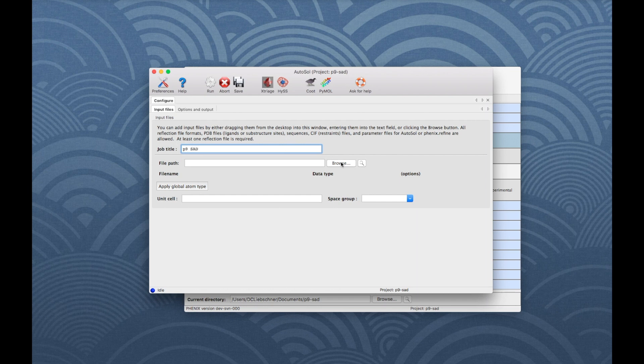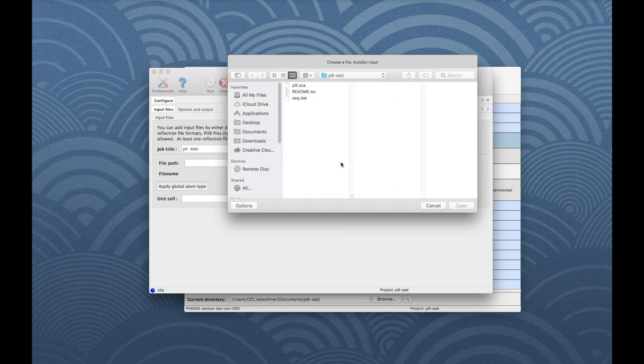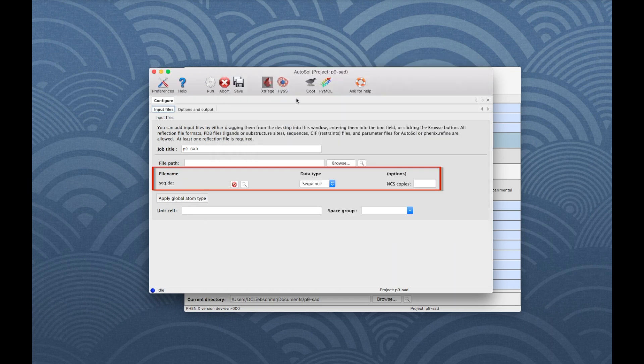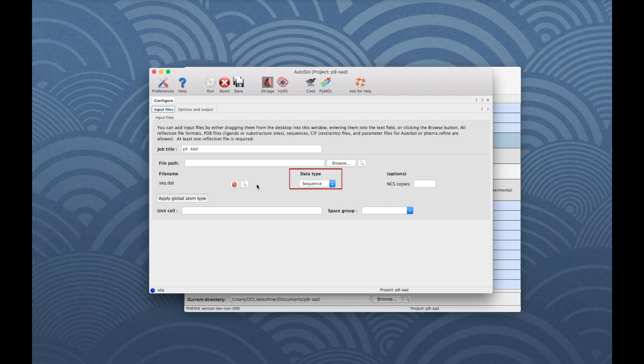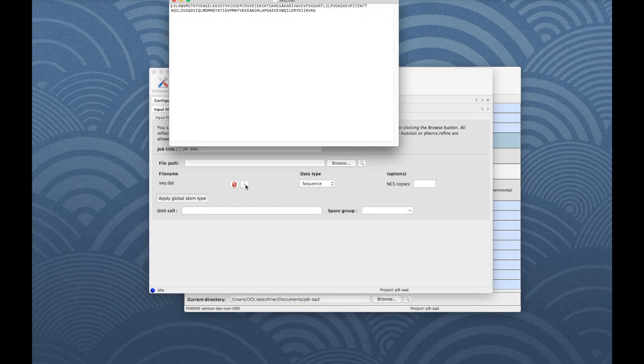To load files, click on Browse and double-click on seq.dat. The GUI now lists this file and assigned a data type to it. Seq.dat is correctly listed as a sequence file. If you want to look at the file, click on the magnifying glass.